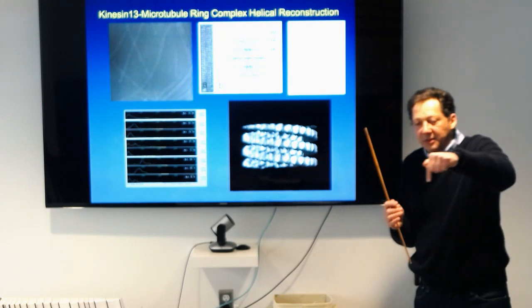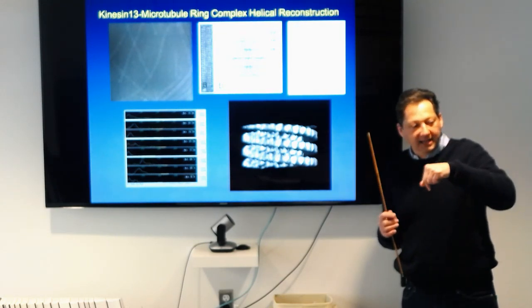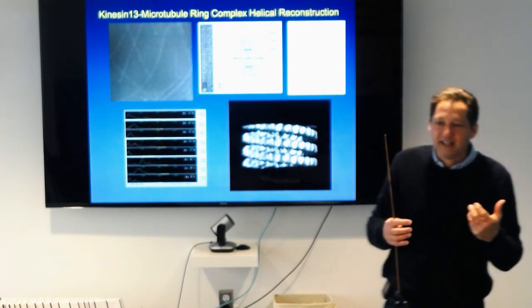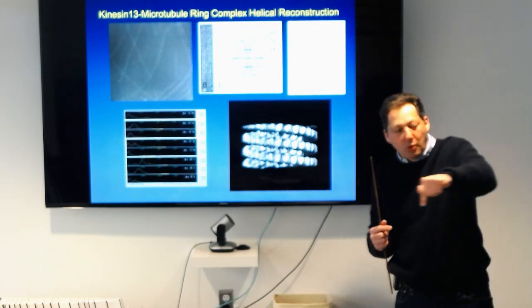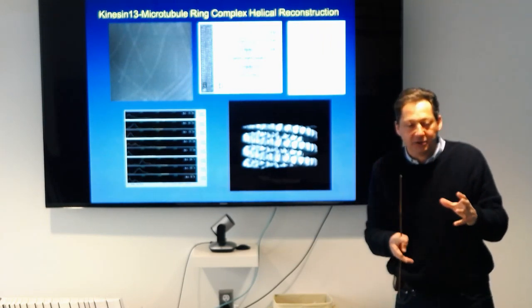When we talk about the rotation per subunit of the helix, that usually refers to what used to be called the genetic helix. You find a helical path that goes through every subunit, and that's what defines your helix.